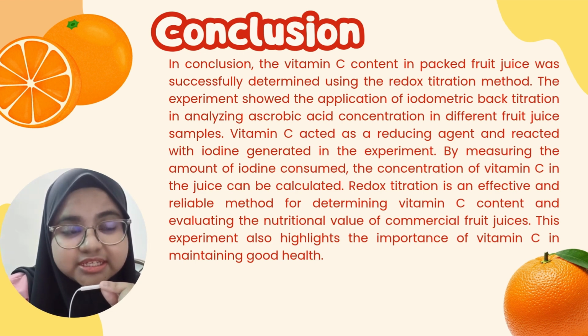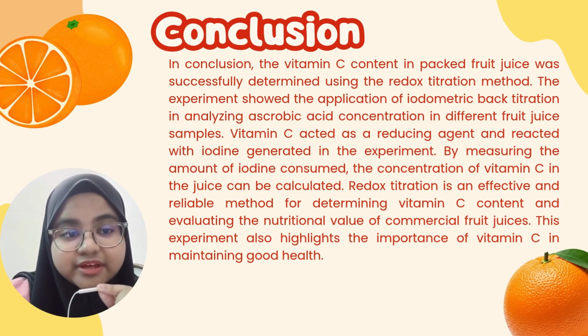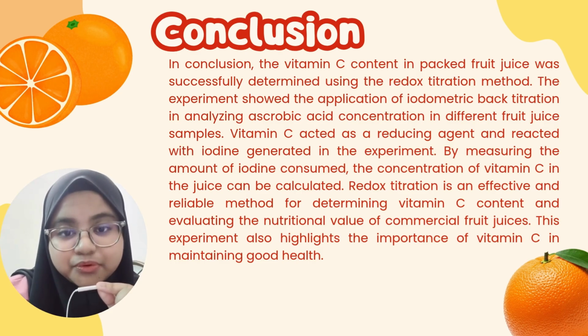Redox titration is an effective and reliable method for determining vitamin C content and evaluating the nutritional value of commercial fruit juices. This experiment also highlights the importance of vitamin C in maintaining good health.